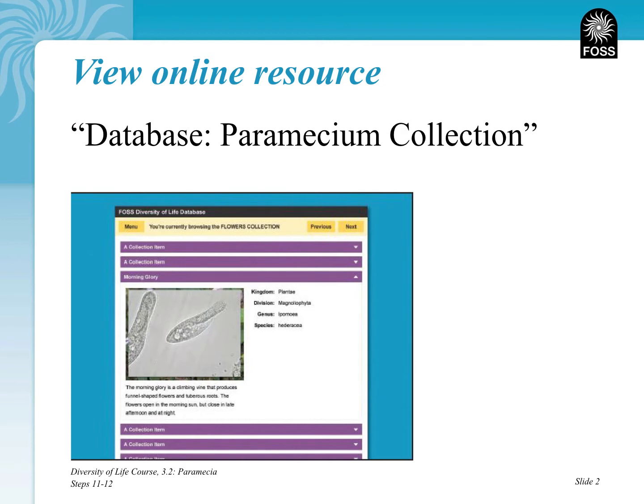In the last lesson, we showed you a couple of videos about the Paramecium and how they were moving around, how they behaved, their twisting and spinning and bumping into each other, and just overall the whole way that they move. And that's fairly a good way to tell if something is living or not. You can tell just by kind of looking at it. But this one, we're going to look at this database Paramecium collection to be able to find some more specific things as well, some specific actions that would help us prove that a Paramecium is actually a living thing, and I'll show those to you next.